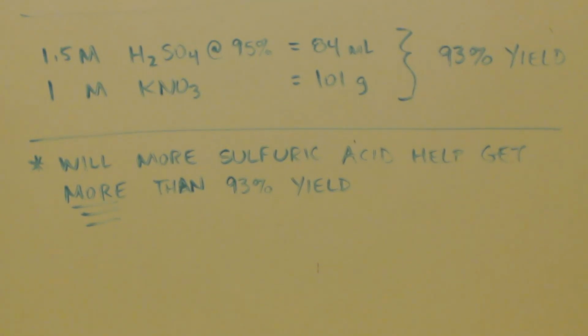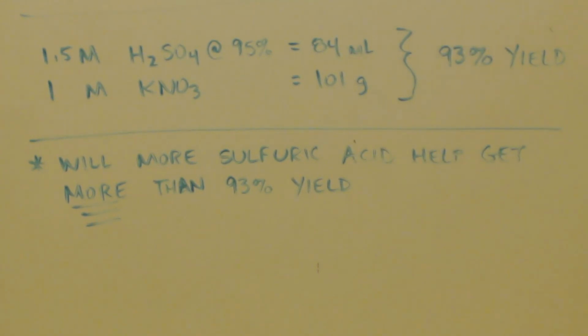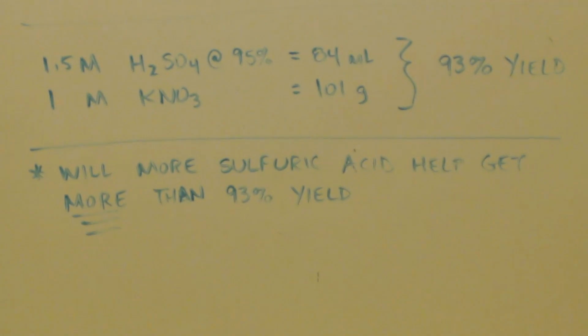The question is, will more sulfuric acid help you get more than 93%? I actually wanted to do that in this video, but I kind of messed up. But this is the ratio. If you want 93% yield, that's what you do. Every 101 grams, put 84 milliliters. That's a pretty good jump from 50 to 93. That's my best jump ever.